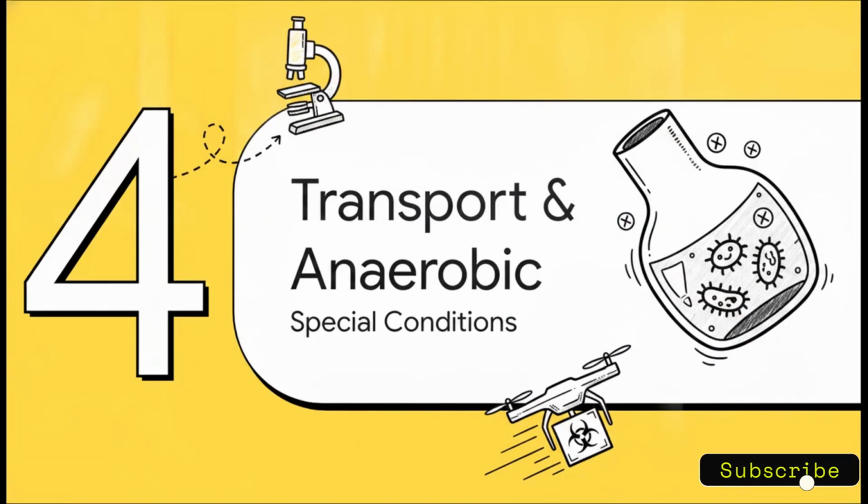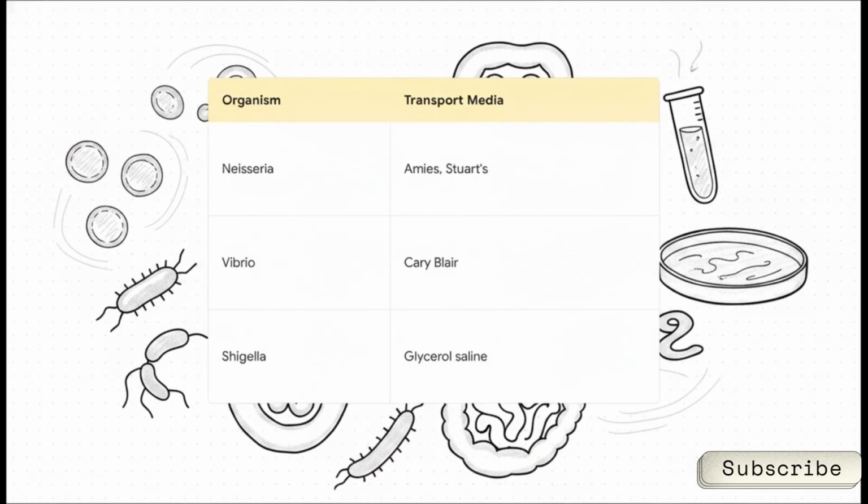All right, shifting gears to Section 4, Transport and Anaerobic Media. What exactly happens when your lab is miles away, or when you're dealing with bugs that literally die in the presence of oxygen? First up, transport media.